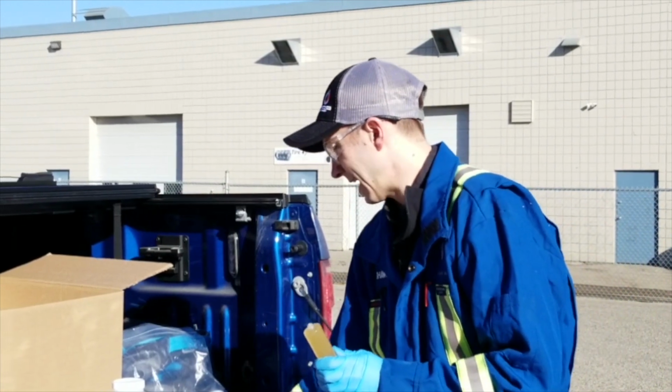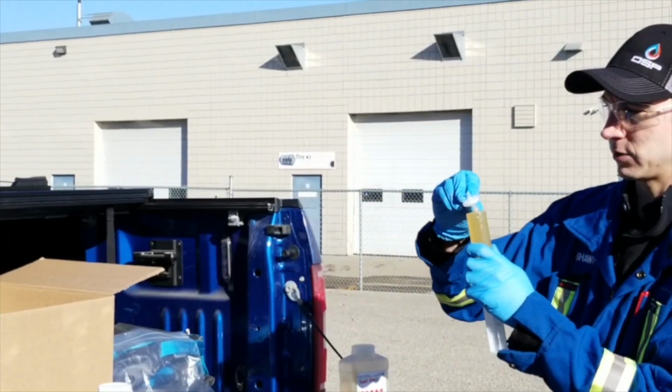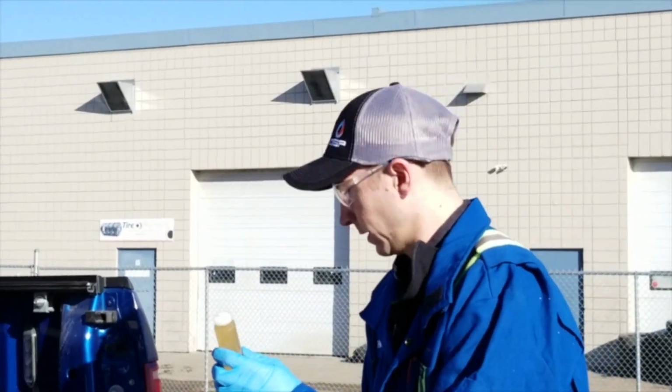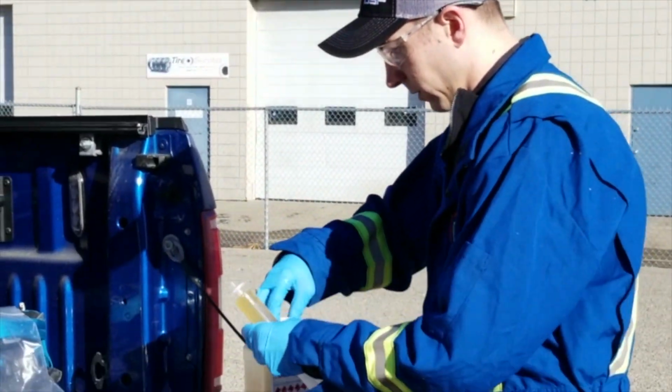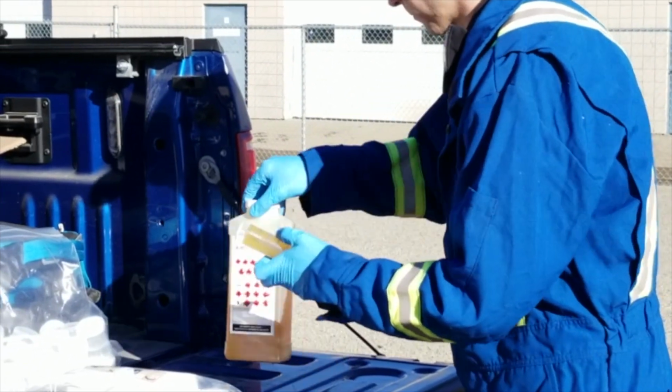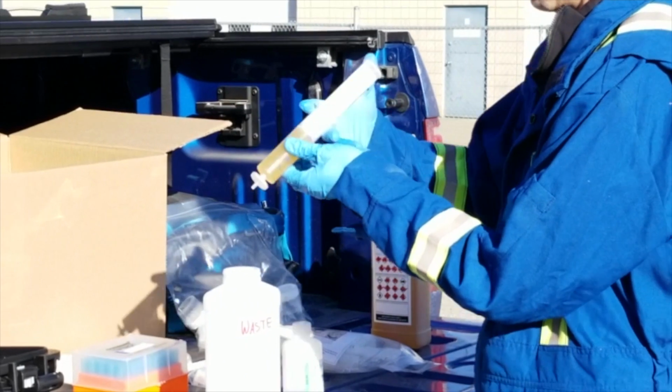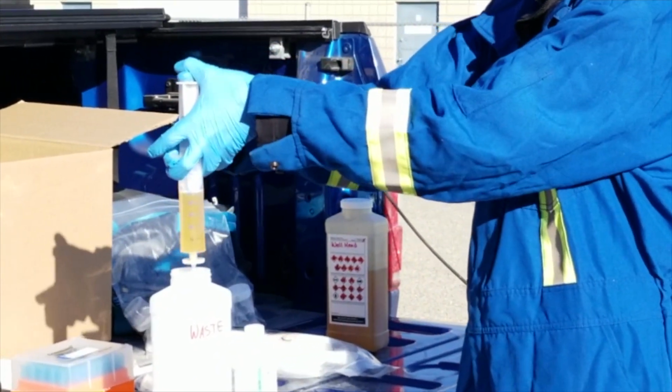Step 2, we're going to attach our ATP filter. It just screws on to the syringe like that. And we're going to filter this fluid volume into our waste container. Effectively what that's doing is capturing all of the microbes in our liquid on the filter.